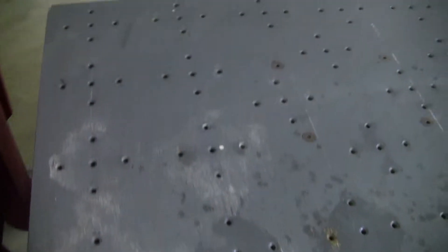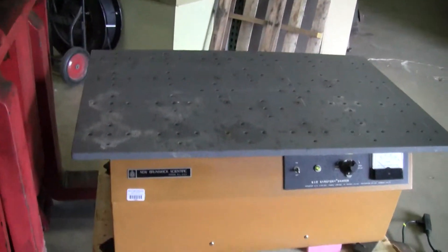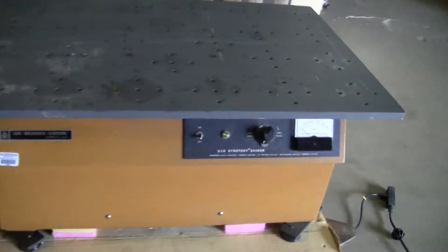This one has the larger top on it. It's 24 inches by 36 inches. Let's turn it on and take a look.